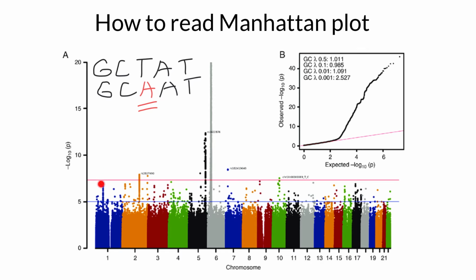Now let's return to this graph. As you see, at the very bottom we see a solid color, but actually it consists of many dots. We analyzed between 500,000 and 1 million such SNPs, but here they just look solid because of the sheer number of these dots.